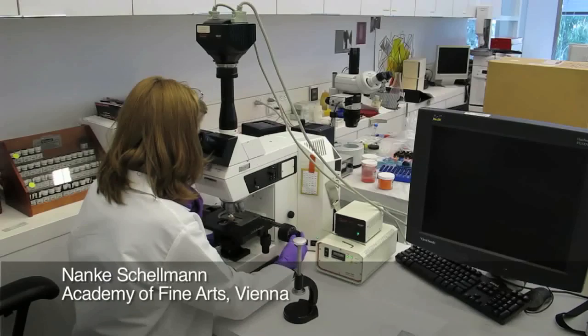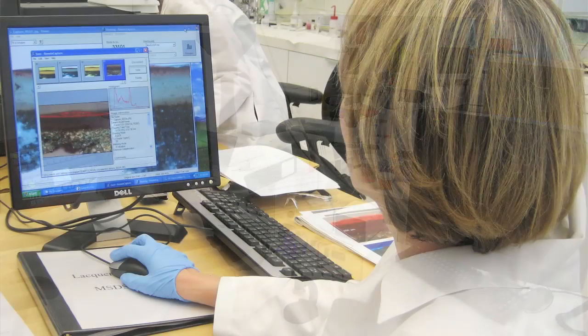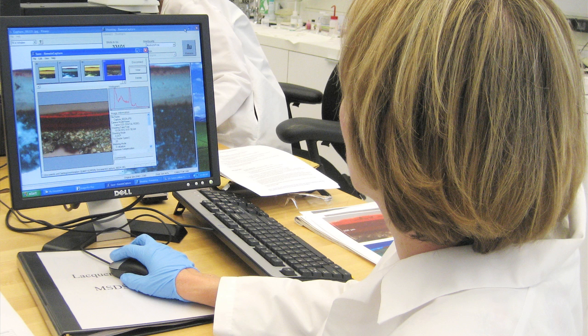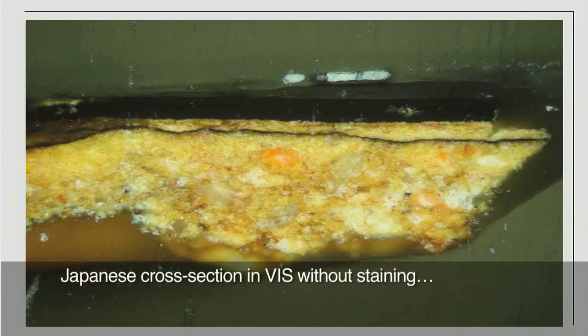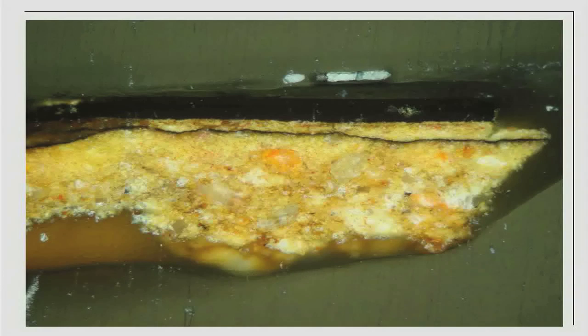Here it can be checked whether the surface is suitably prepared to start the staining procedure and also the initial photographs of the cross-section can be taken in visible and blue light. This image shows a cross-section of a Japanese lacquer coating in visible light, as seen through the microscope.